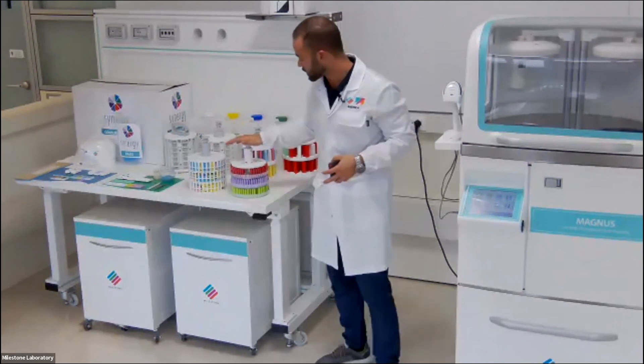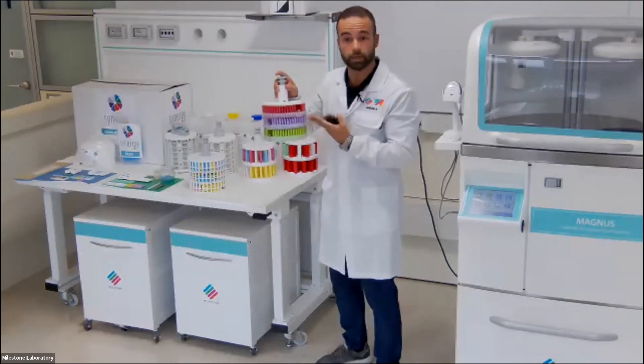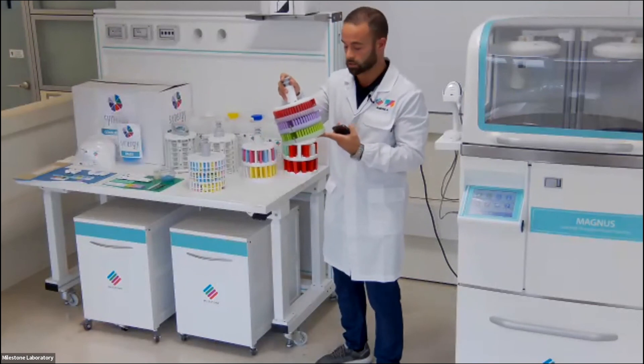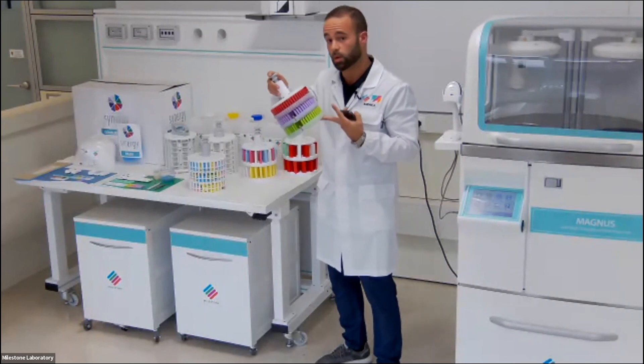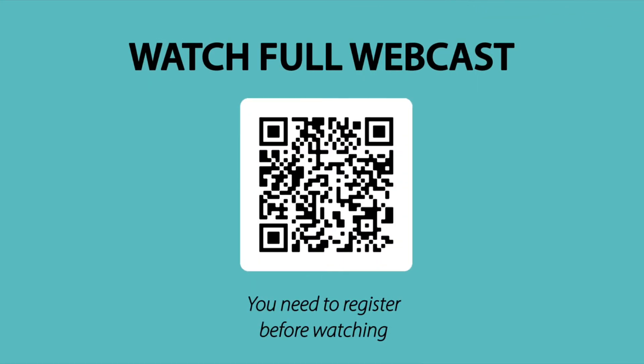We have the split rack with layers that, as you see, are organized. This allows a better circulation of the reagents, so better processing. So, let's take a look at it.